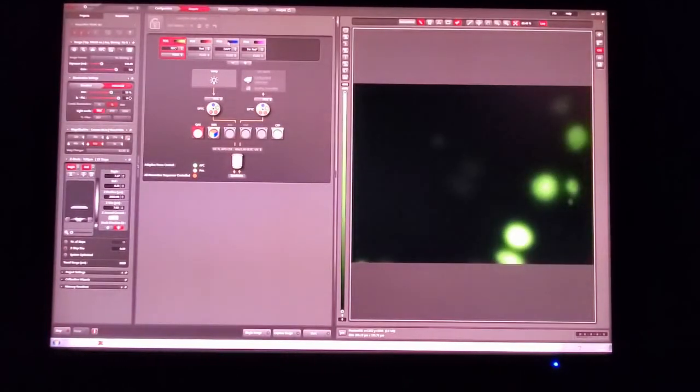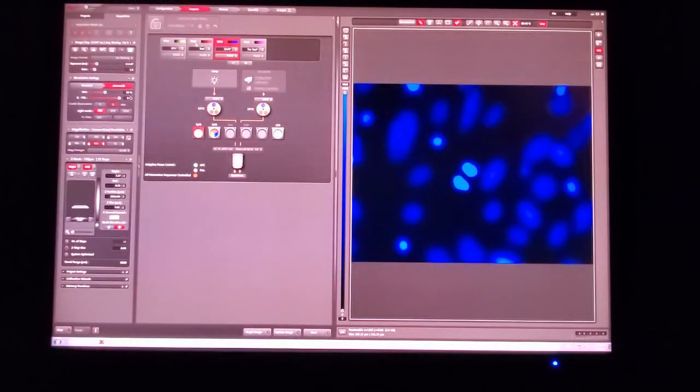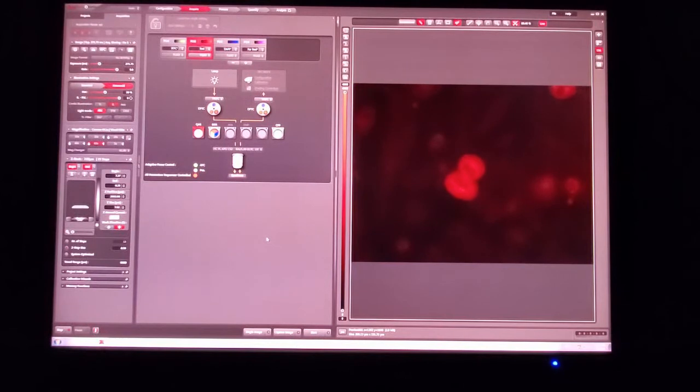To perform the Z-stack, all you have to do is move the height control wheel in one direction until the cells are out of focus. Mark this as the beginning of the Z-stack. Then move the control wheel in the other direction past the in-focus point until the image is out of focus again. Mark this as the end of the Z-stack. Then you can hit start, and it should acquire the Z-stacks of all the channels listed. Fairly straightforward, but I think watching the images get captured is also quite beautiful too.